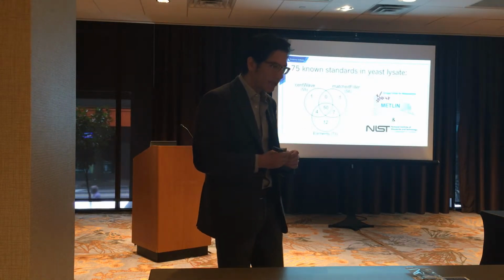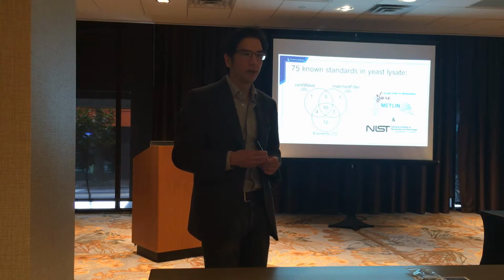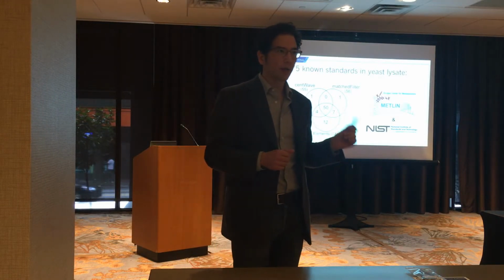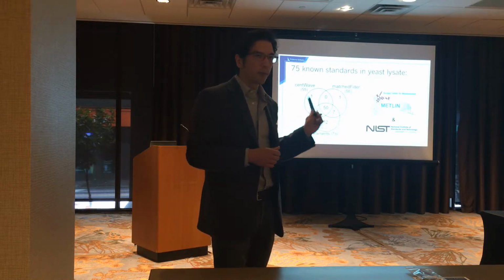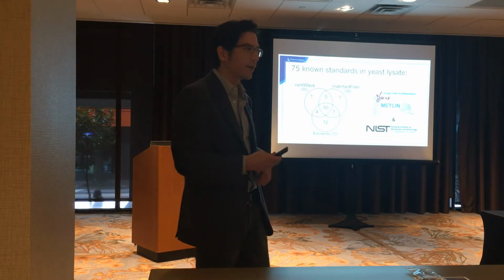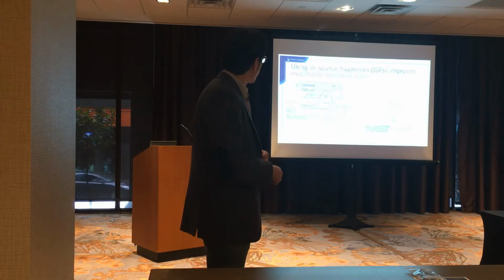So to kind of benchmark this with Elements, we ended up using this data set that contained 75 known metabolites injected into a yeast sample. And then analyzed them, benchmarked them against a bunch of other approaches in the wild using XCMS, and found that Elements was doing just better in general in terms of being able to pick up peak features. So we were able to find 73 of the 75 known standards, searching them against the Metlin and the NIST databases. These are databases that are included in Elements by default.